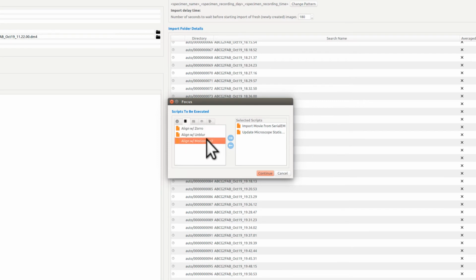After that, we want usually to apply MotionCor2 to do drift correction, and then run GCTF on the drift corrected movies, or CTFFIND4. We can measure the iciness. We push status data to the website, and then we can clean the scratch disk if you want to. And we can also go and pick particles with Gautomatch. That would be there, and that's usually all we need to do at this time.